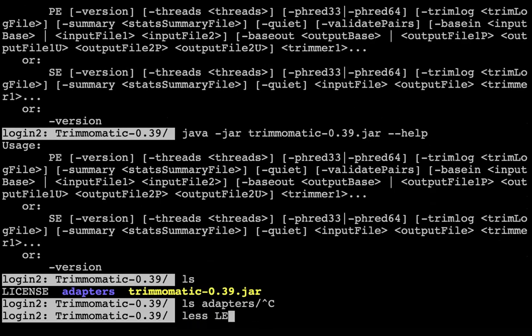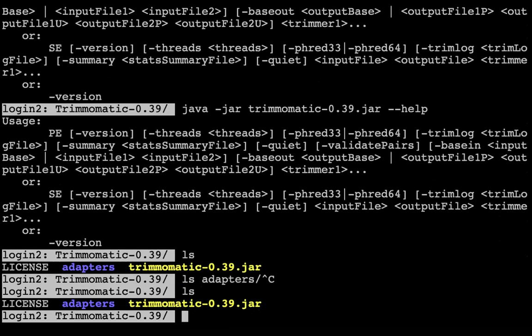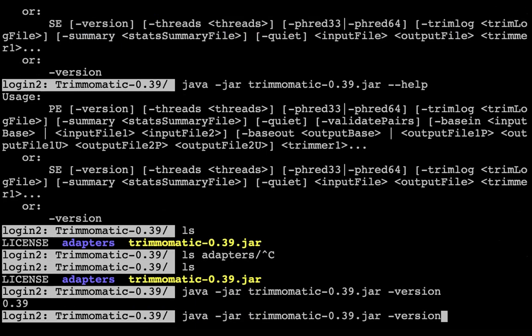And where's the full help? For some reason I don't remember what the full help is. So we're not going to actually run the software because we're really worried about time. But basically, you just have to go through the help. I think there should be a manual online, and then you download the PDF. And yeah, so the command should look like this.